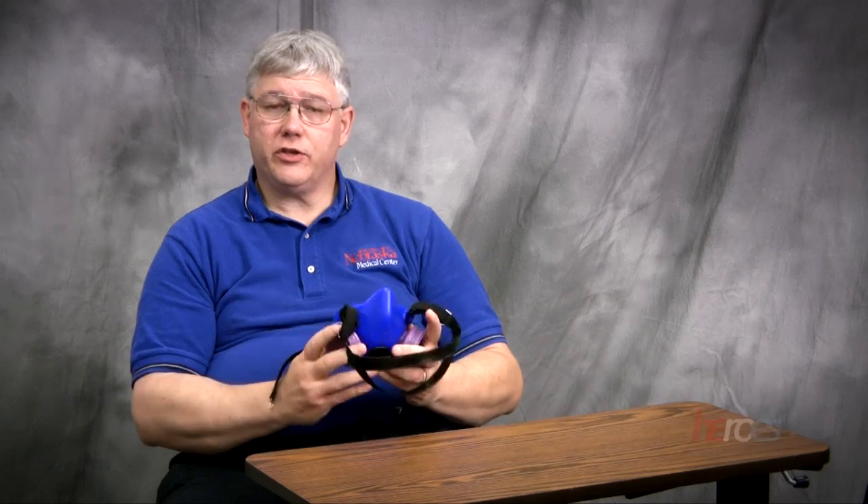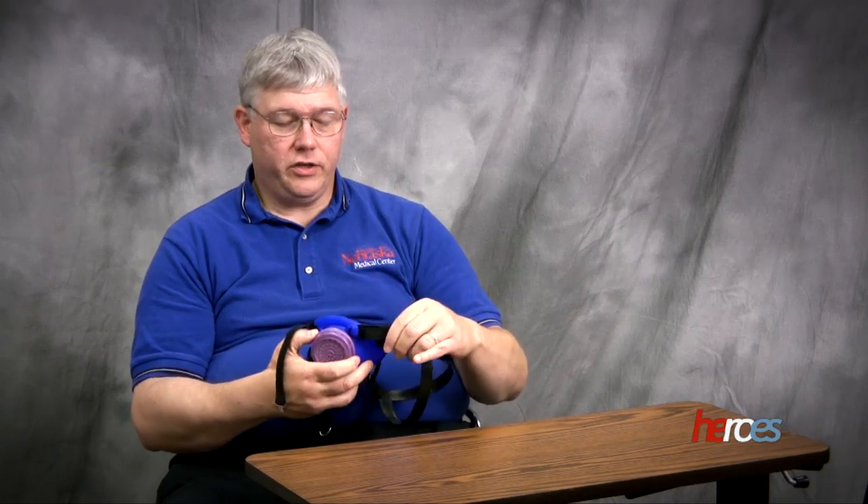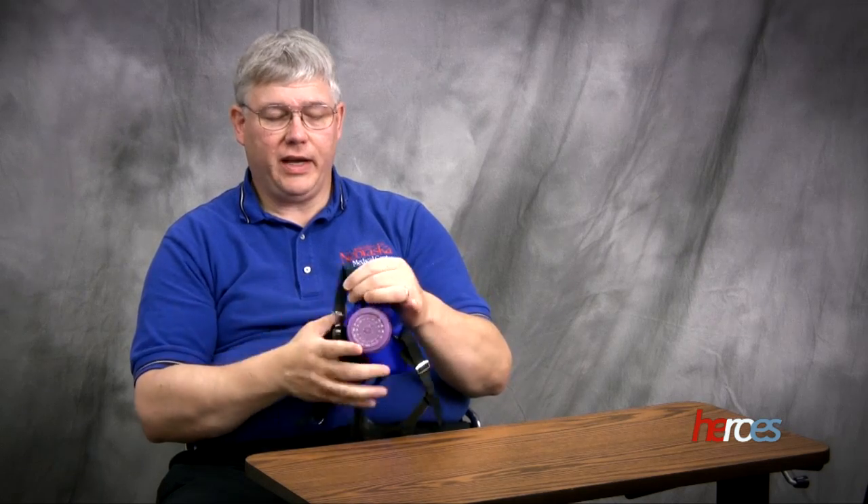I'm going to teach how to don and doff a half-mask respirator. The first thing you want to do is make sure you check the respirator to ensure that the straps are in good condition — they're pliable, and when they stretch out, they bounce back.